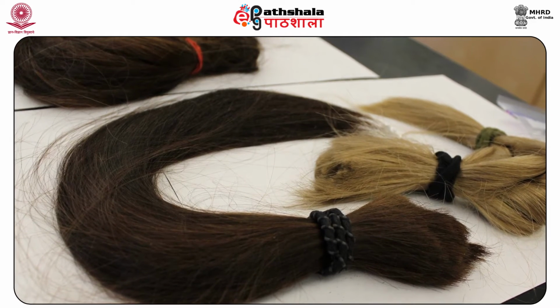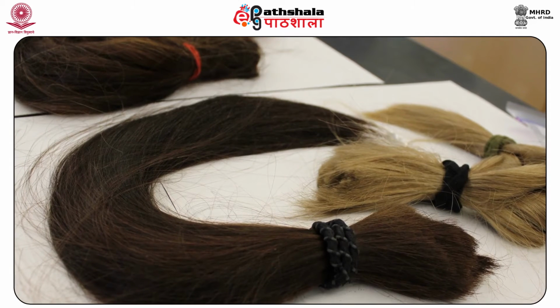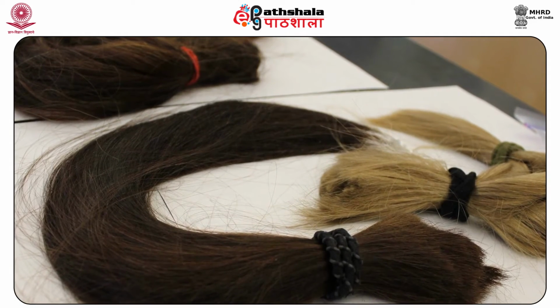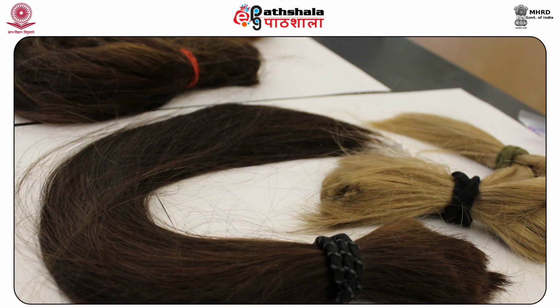The portion of the hair that is dyed may be long or short depending upon the period between the dyeing or bleaching and the collection. The examination also reveals the part of the body from which the hairs have come, that is, the head or other parts of the body.